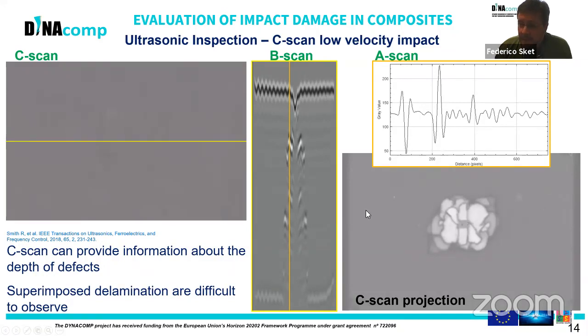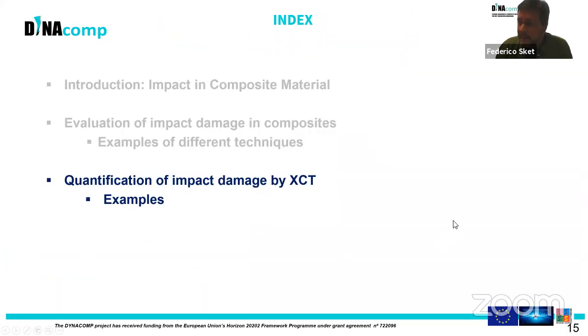However, due to the superposition of the different effects, you have less and less intensity, and it is difficult to observe information from superimposed delaminations here. And this takes us to another technique, which is called X-ray tomography.